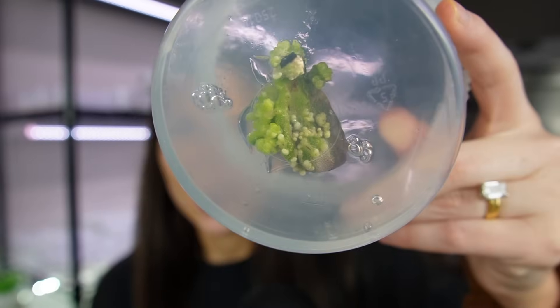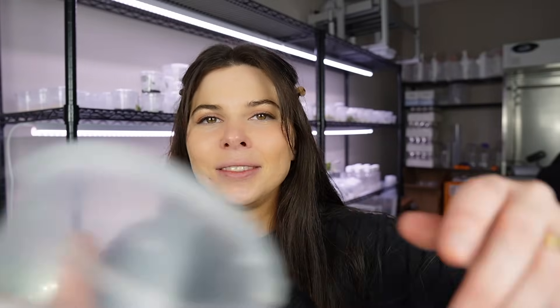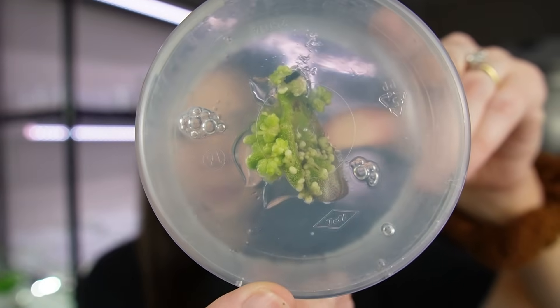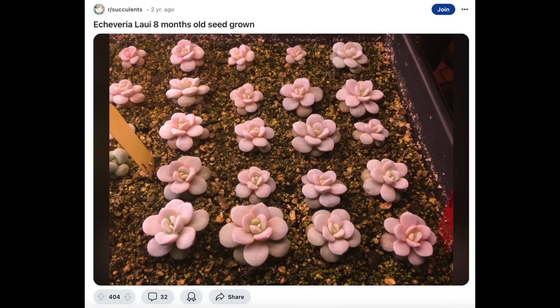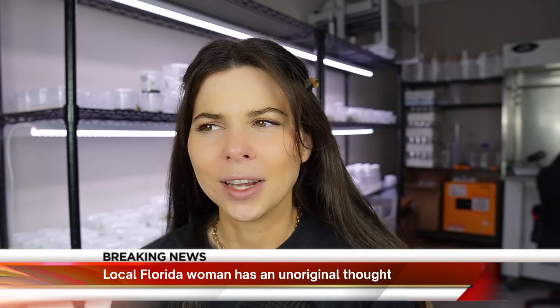These are some Echeveria Lowys that I've had in tissue culture for about eight weeks now. You can see there's a lot of tissue growth and even some baby plants starting to form. Back around 2016, when we were all really into succulents, I wanted an Echeveria Lowy so badly but they were like hundreds of dollars. When I bought this one for the video, it was only about $20 — and there were ones on there for like $10. It's just crazy how plant prices change over time.